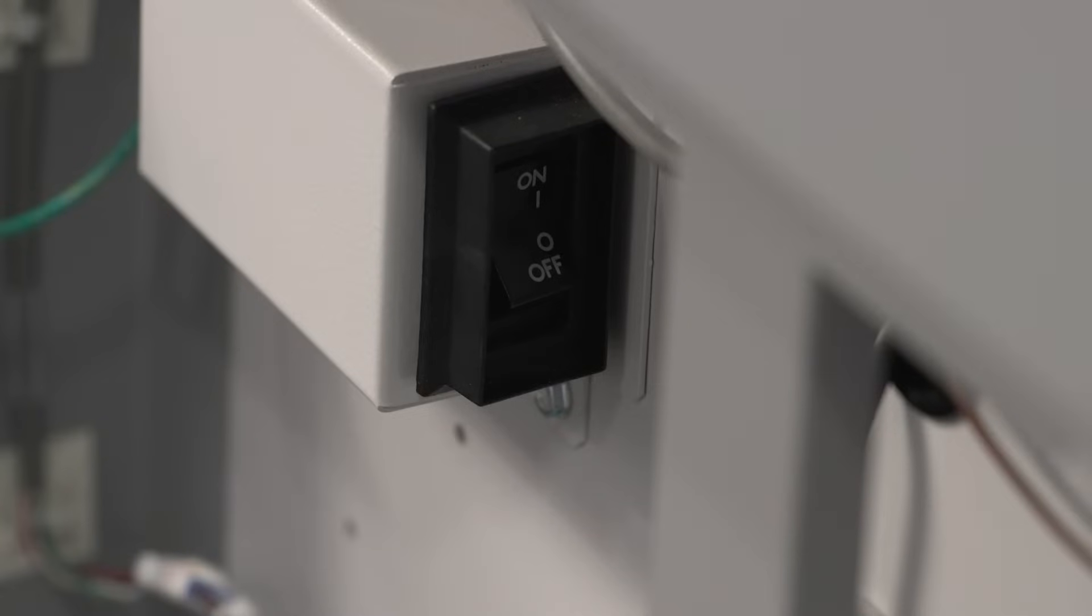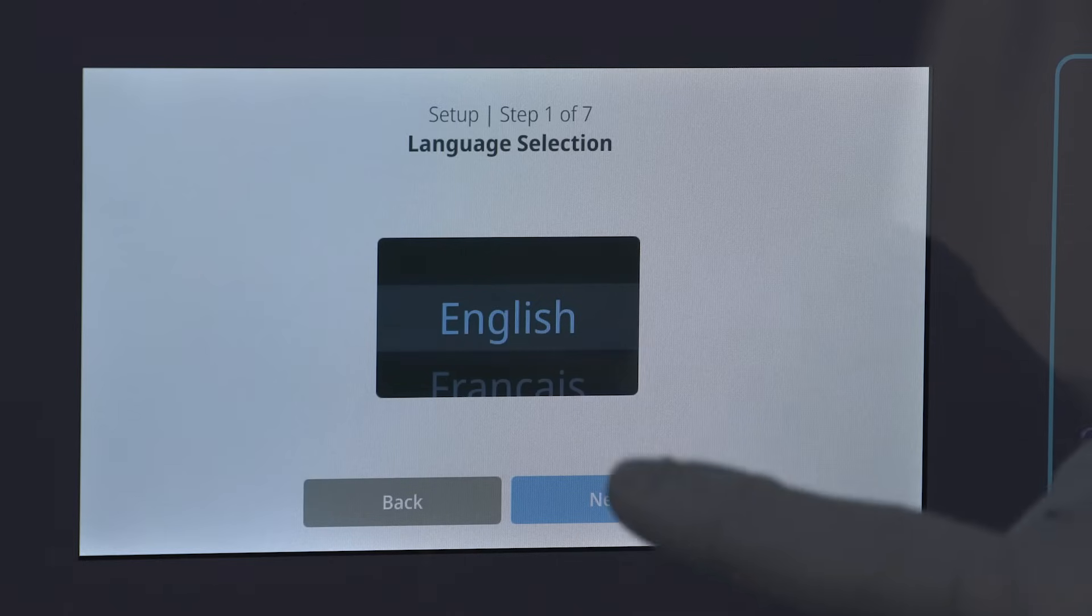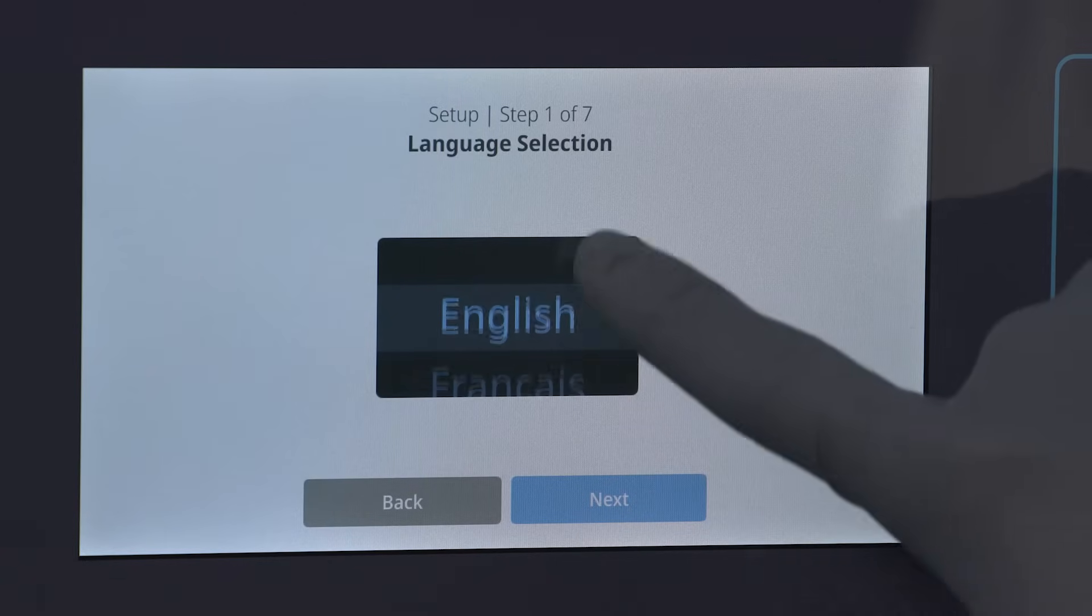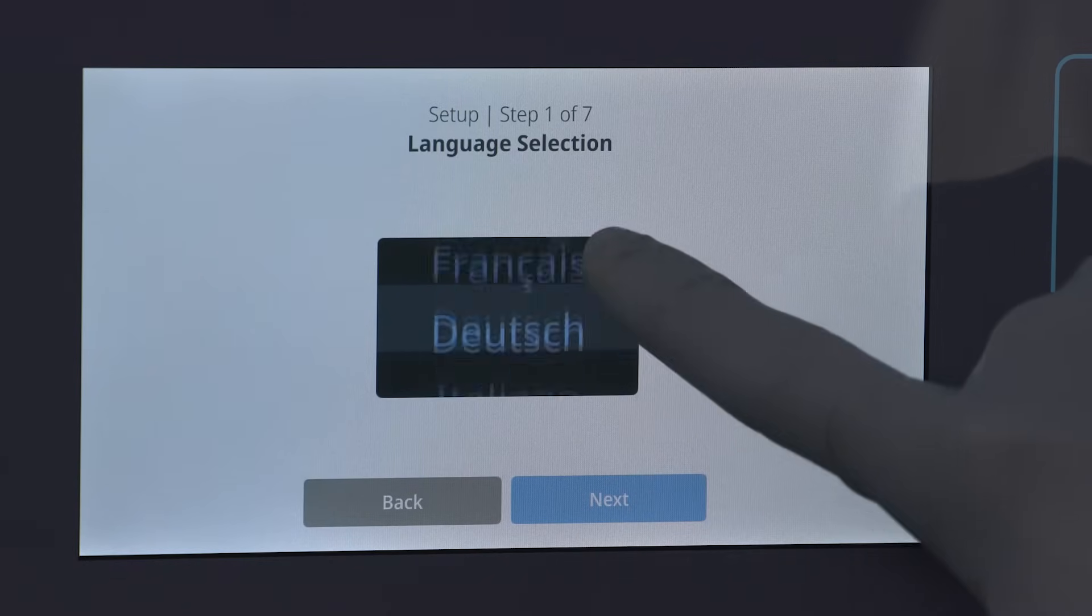Now that the unit has power, the freezer will go through its startup wizard and begin to adjust to your desired setpoint temperature.